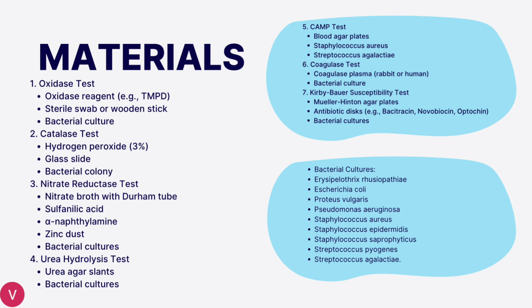The bacterial cultures we used included E. rhusiopathiae, E. coli, Proteus vulgaris, P. aeruginosa, S. aureus, S. epidermidis, S. saprophyticus, S. pyogenes, and S. agalactiae.